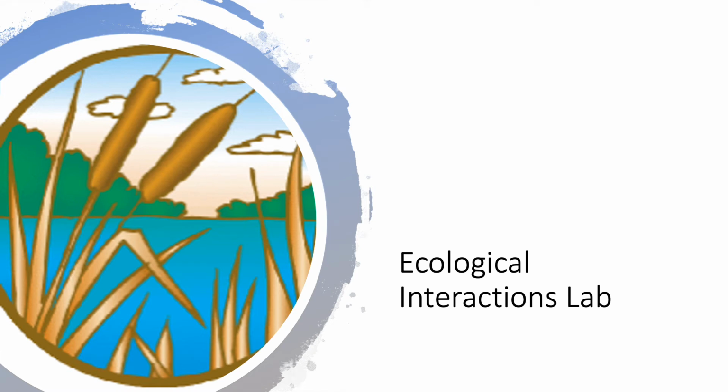So let's just walk through this Ecological Interactions Lab together and make sure that we understand what we should be seeing as we walk through the steps of the lab. In experiment 1, I want to make sure that as you're viewing this video, you have printed off or have digitally available the procedure for this particular experiment. So for experiment 1, note that we really don't need very many supplies. We need vegetable oil, water, a 10 and 100 milliliter graduated cylinder.